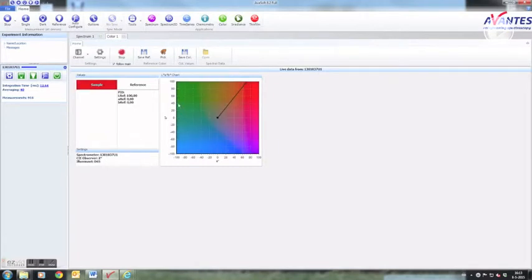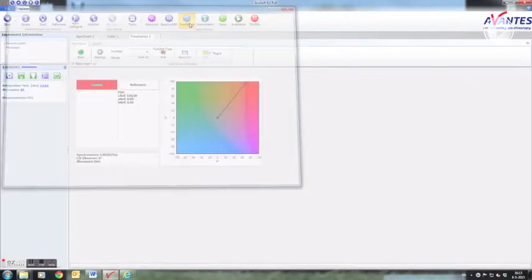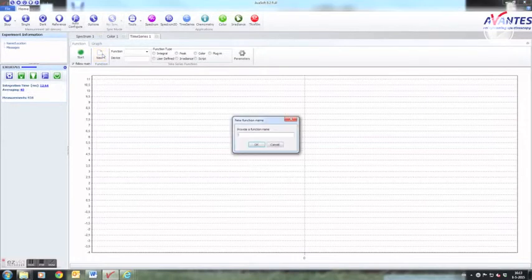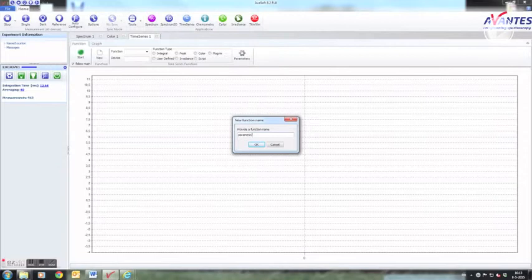To follow parameter A in time, select the time series button. A new tab will open. First we need to define a function by pressing new and entering a name for the function.